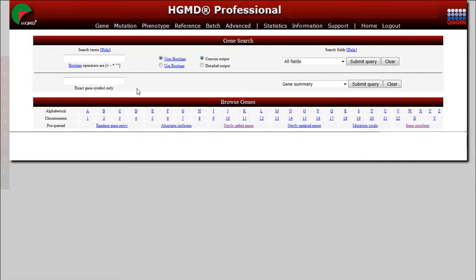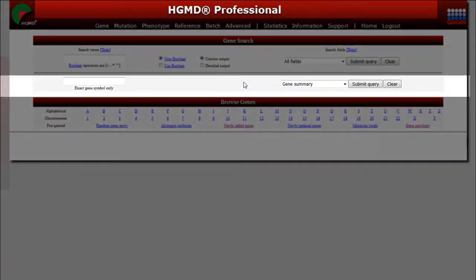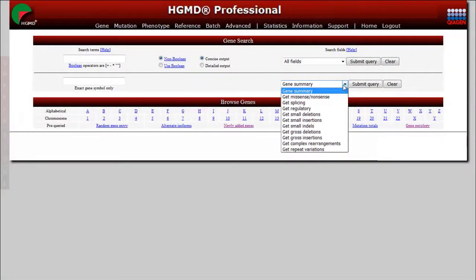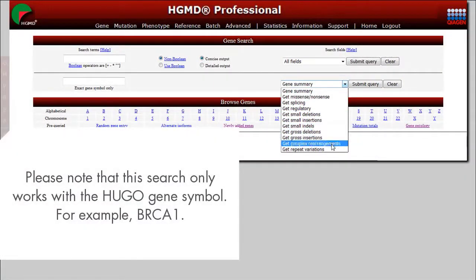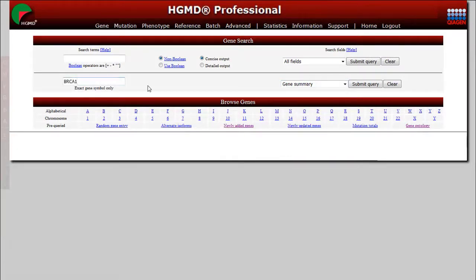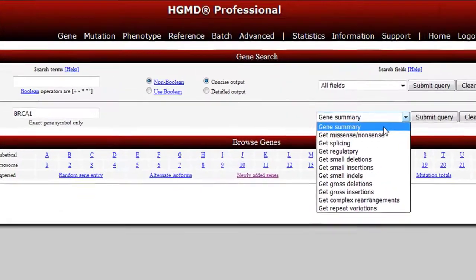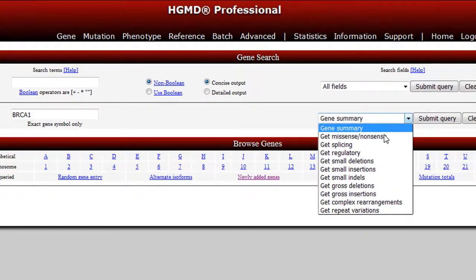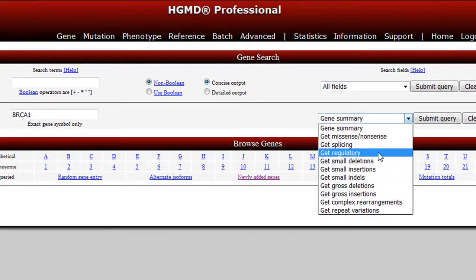There is a secondary search which allows you to jump to a specific mutation data set for a particular gene, shown in the drop-down menu here. Please note that this search only works with the HUGO gene symbol, for example BRCA1. For this search, it is possible to jump to the gene summary report as well as to specific classes of mutations for the gene.